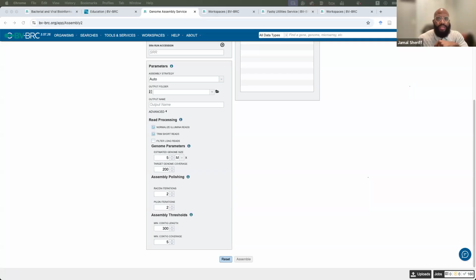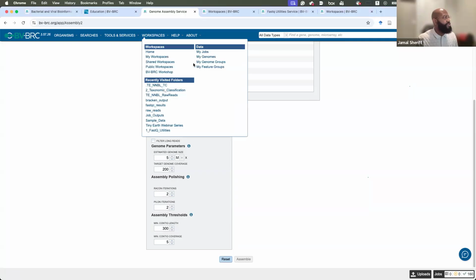All right. So if no, double check. All right. So we have no questions. Then at this point in time, you submit your job. We're going to go on to looking at our results.